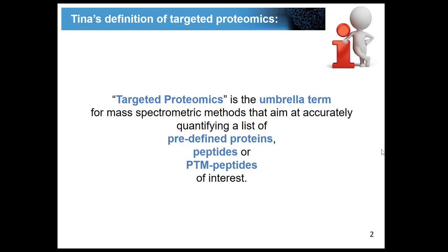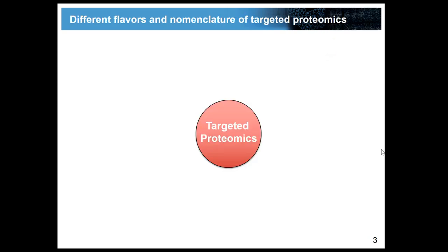Instead, what you do with targeted proteomics, you always try to specifically look for proteins or for PTMs for which you already have a hypothesis, or which you think are important and interesting for your specific project, and then you try to validate or to falsify your specific hypothesis for these proteins by using a targeted proteomics approach. Okay?